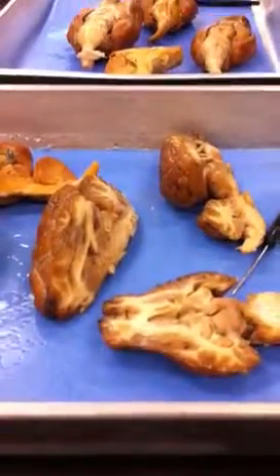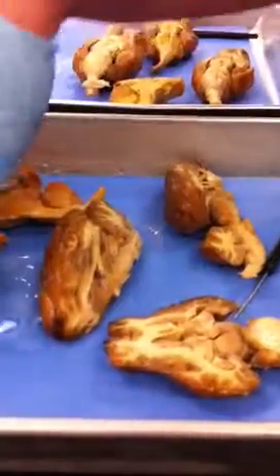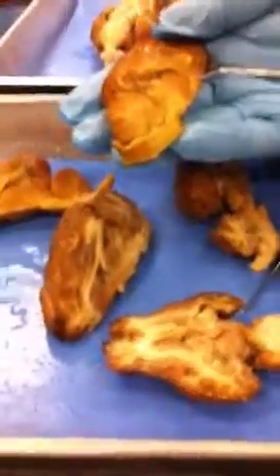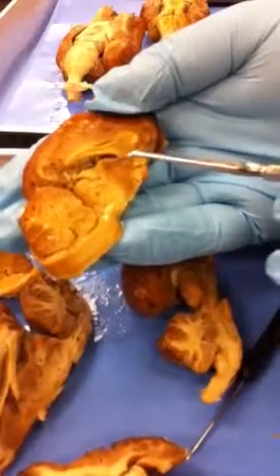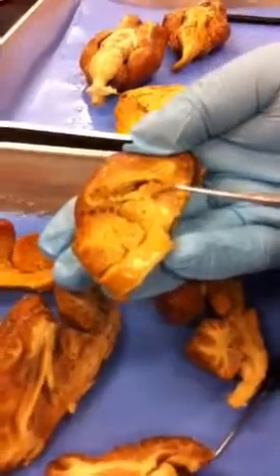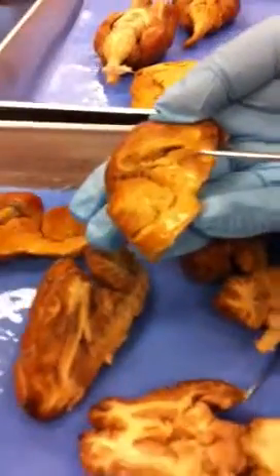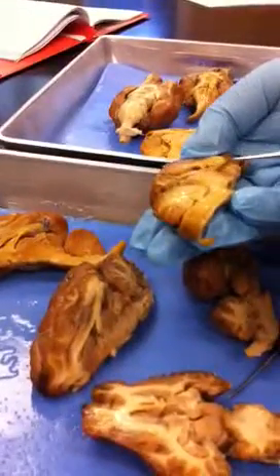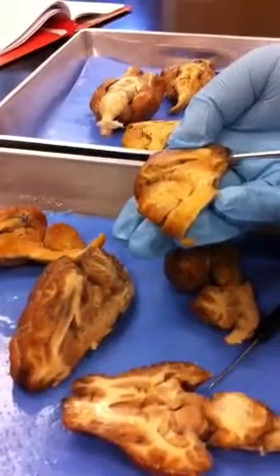Okay, so when we talk about thalamus, don't worry about intermediate mass, just thalamus is fine. So you'll look for the diencephalon. Keep in mind that the optic chiasm is your marker for the hypothalamus. Just above the hypothalamus right here is the thalamus, this round body resting inside the third ventricle. Can you turn it this way? We can't see it. Yeah, this right here is thalamus. Here would be hypothalamus next to the optic chiasm.